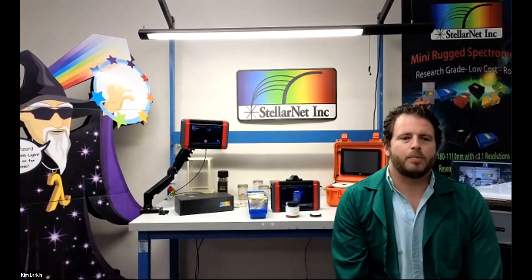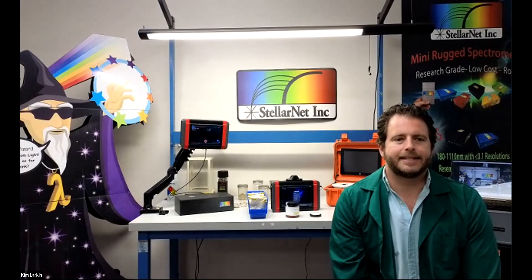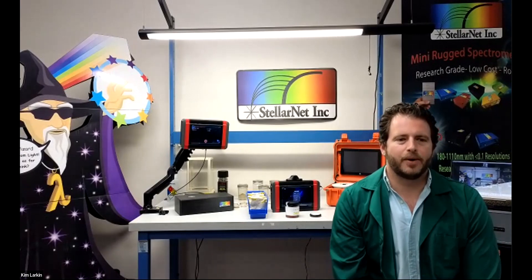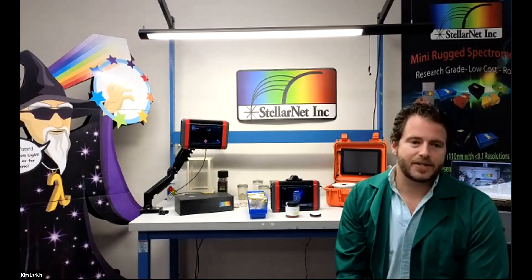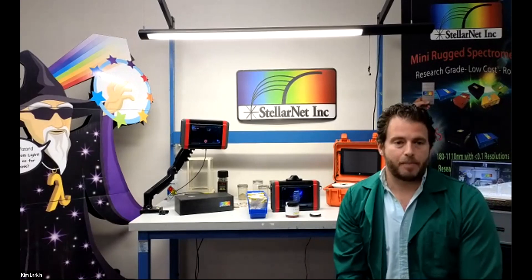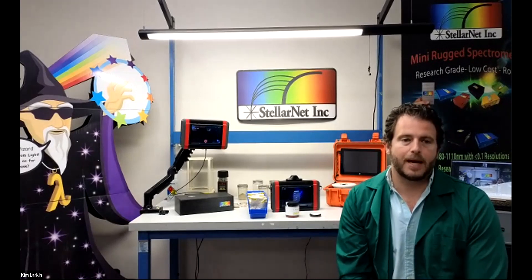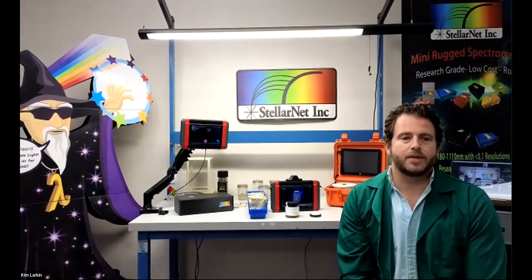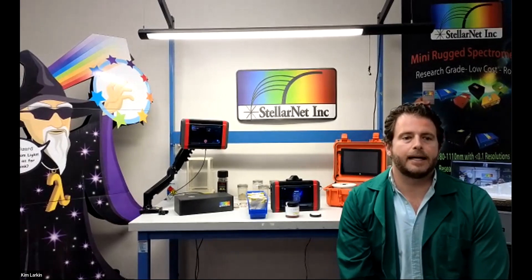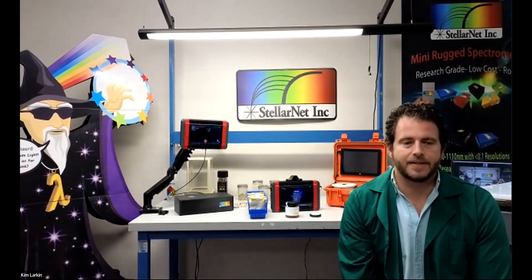Today I will be using our technician mode. Our near-infrared analyzer has a lot of capability in administrator mode. It allows you to add samples to your database of nutraceuticals and make calibrations for custom blends.